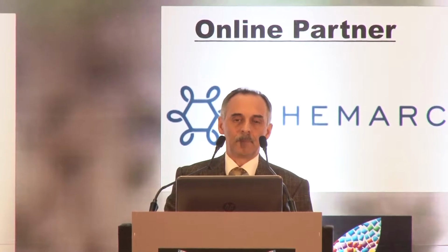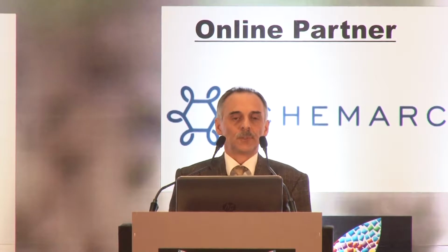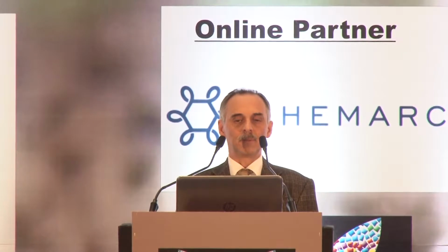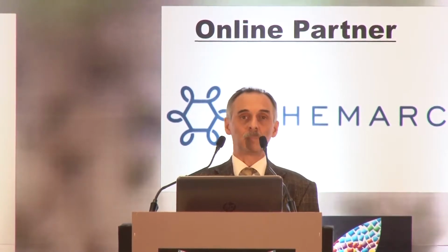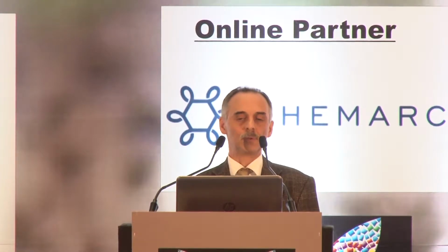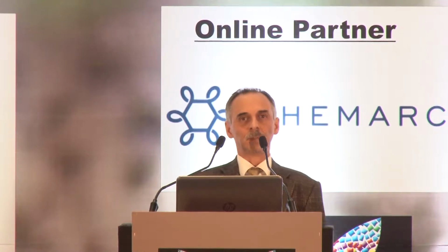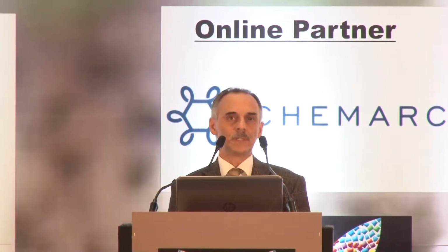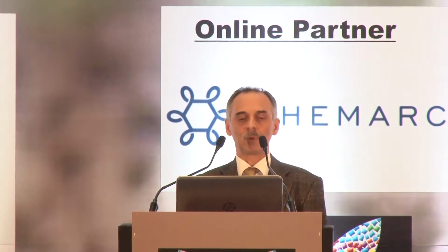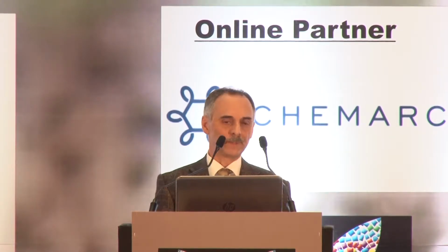Here are the main steps of the test procedure of the ISO 23900. First, we have to mount the screen pack which we want to use for the test. Then we start the test line with a basic test polymer, and then we fill the test mixture into the extruder. Then we can start the test, and after the hopper is empty, we purge the equipment with 100 grams of the basic test polymer. After the 100 grams, we stop the equipment and purge additionally with basic test polymer to prepare the next test.